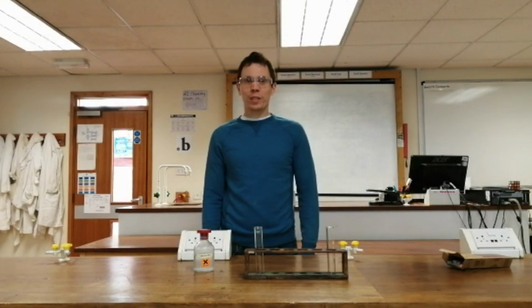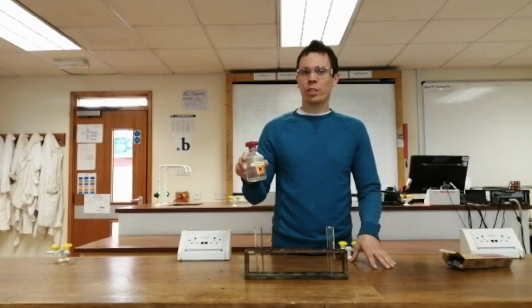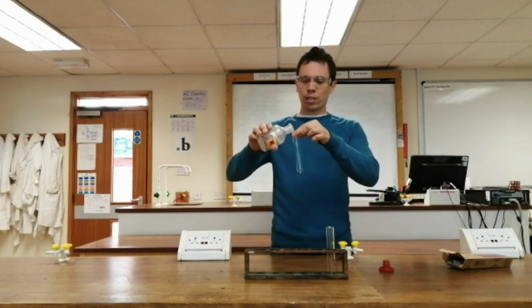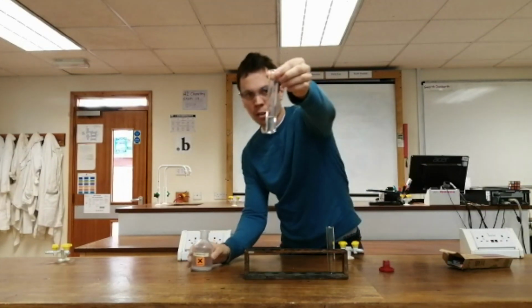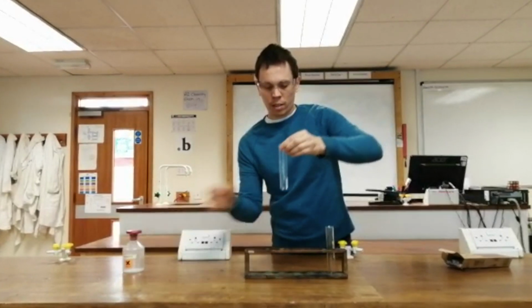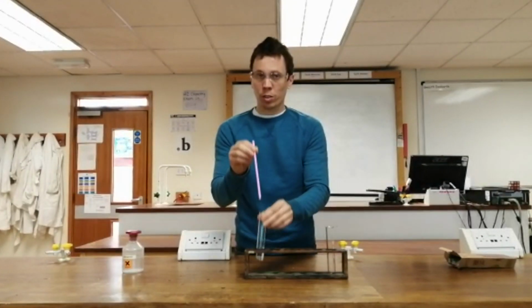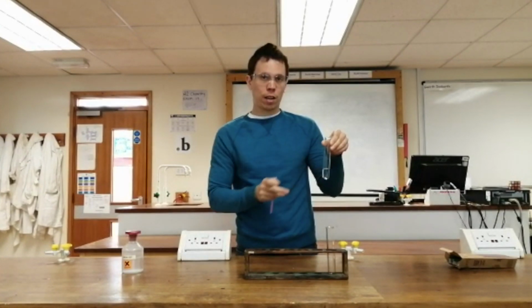In this experiment, we're going to be testing for carbon dioxide gas, and we do that using a solution called limewater. Now, limewater looks just like tap water to begin with. It is colourless and clear and looks just like tap water. Now, there's carbon dioxide in my breath, so I'm going to put a paper straw into my limewater and I'm going to blow into it, and that's going to blow carbon dioxide gas into the limewater.